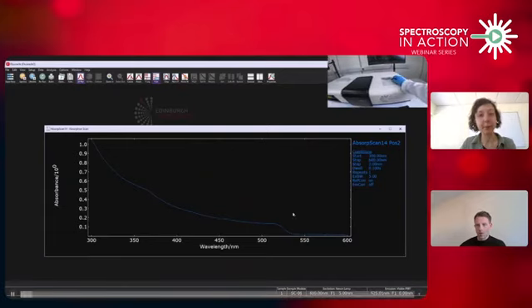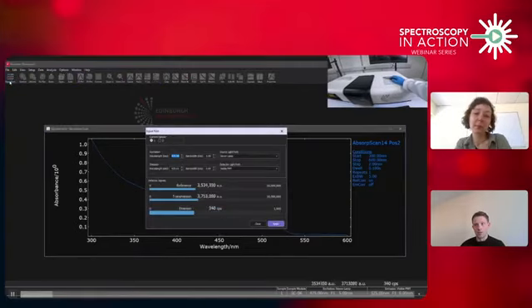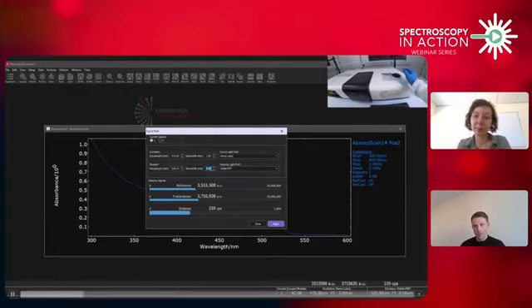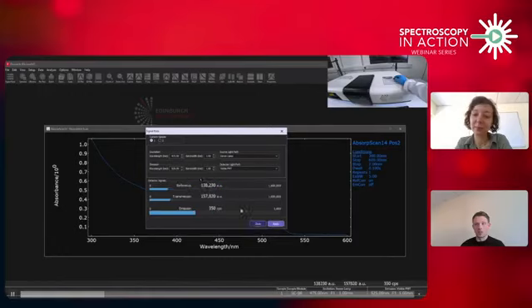Thanks, Maria. So when we want to measure the photoluminescence spectrum, we initially go back to the signal rate window and set the desired excitation and emission bandwidths. Once we've done that, we'll set the sample position to 2 because this is the position of the quantum dot cuvette inside the SC-06. I'm now going to increase the emission bandwidth to get around 1 million counts per second on the emission detector. And this is to ensure that we get good signal to noise in our spectrum.